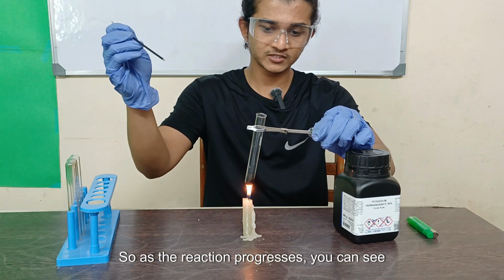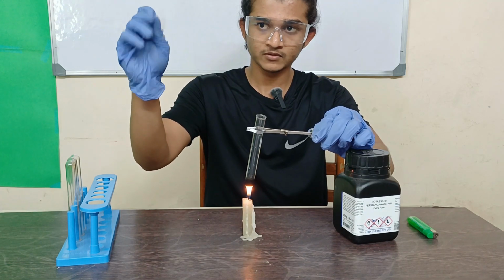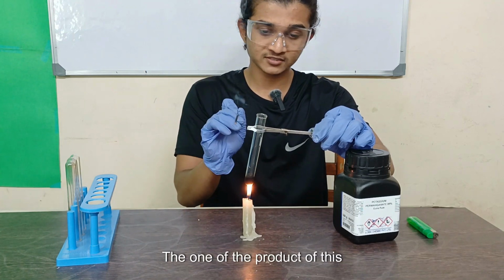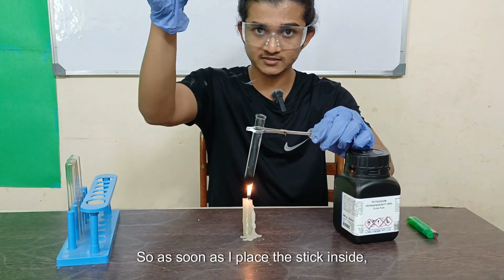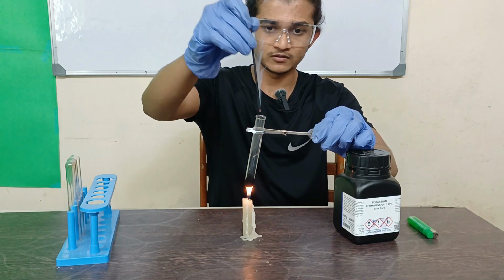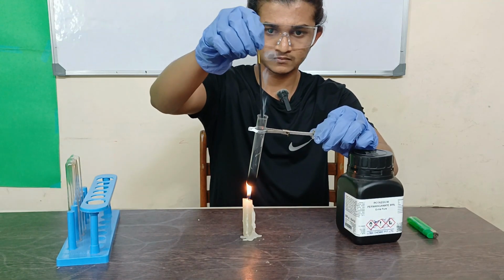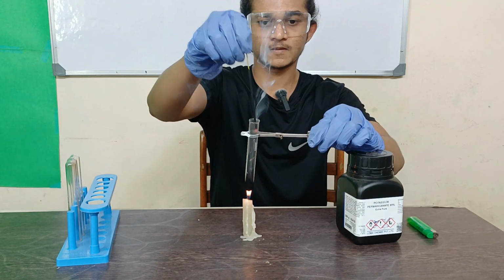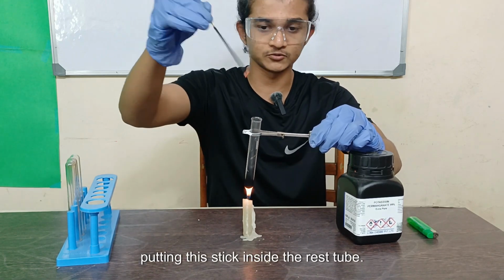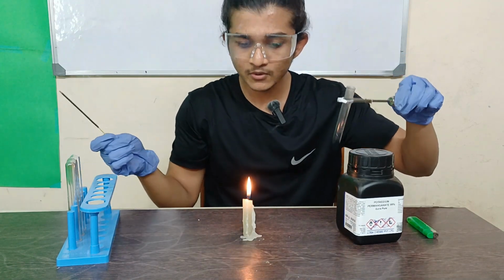As the reaction progresses, you can see a cracking sound being heard now. The reaction is going on. Now combustion requires oxygen, and one of the products of this chemical reaction is oxygen. So as soon as I place the stick inside, it's going to burn very brightly. You just see right now. I can check the presence of oxygen by putting this stick inside the test tube. So yeah, this was the second experiment.